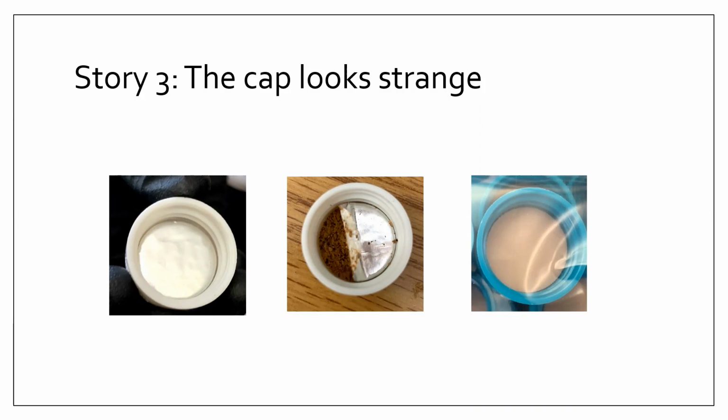So one story is this. I have a formic acid buffer, which is an acid. I had been using it for a month and did not notice anything, but I had a weird contamination problem in my data, and I did not know the source. Usually I put the lid face down on a paper towel to prevent dust from falling into it.